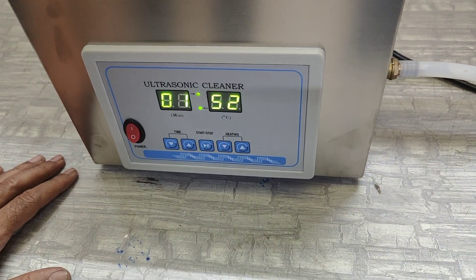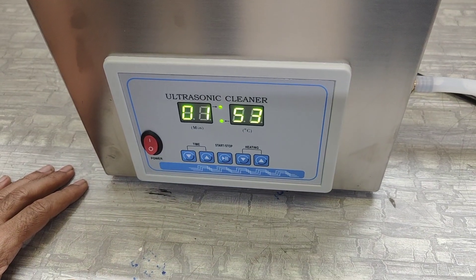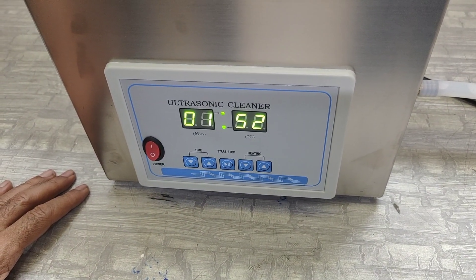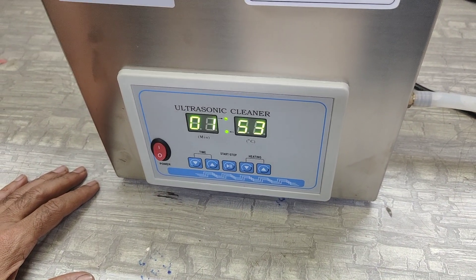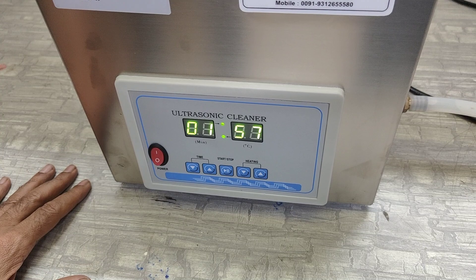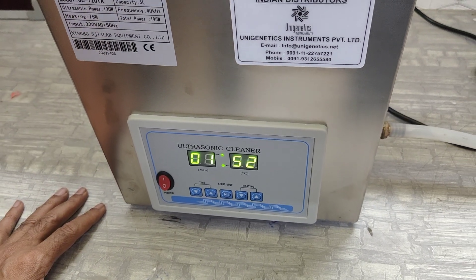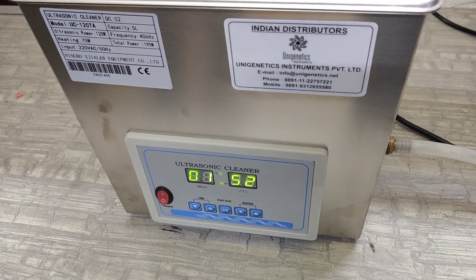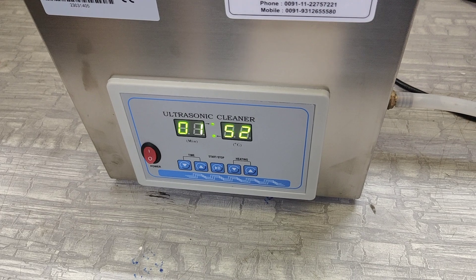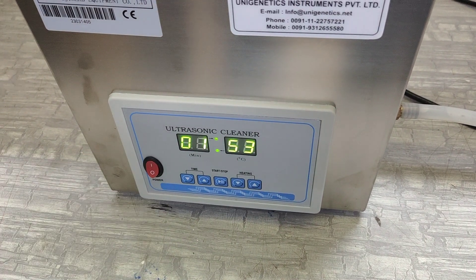Please note that the heating power is only 75 watts, which is not a very large power, so heating is very slow in this machine. If you want to heat the solution faster, either put in some warm water or start the machine earlier so that it gets heated up before use.